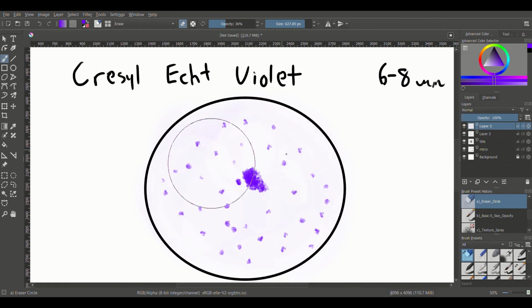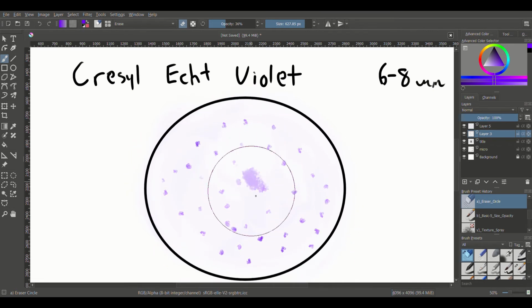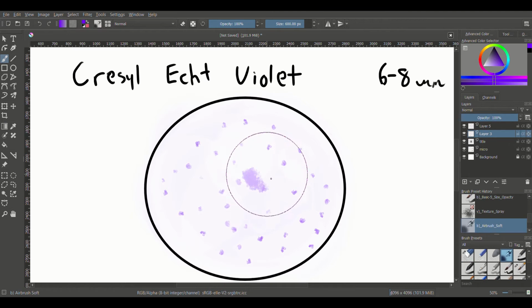It's pretty well gone, though we also get rid of some of the staining overall, and the Nissl substance can be kind of faded out. So it's a shorter method, a lot less frustrating, but you get less intense staining on your Nissl substance and the surrounding nuclei. So that's the trade-off that you're looking at there. That's your second method, and once again, it's a lot easier, but there is that trade-off.